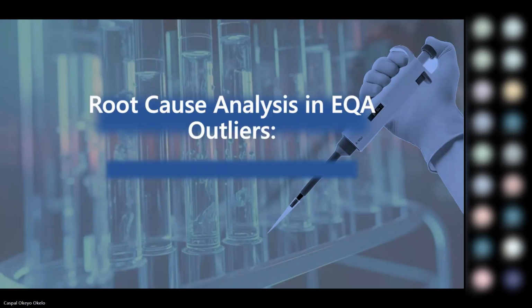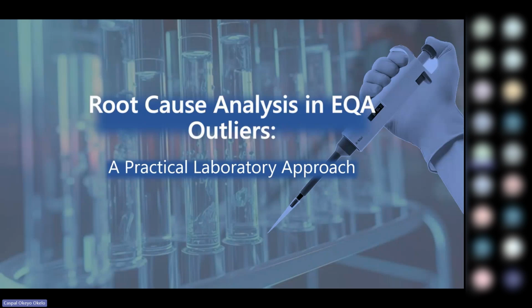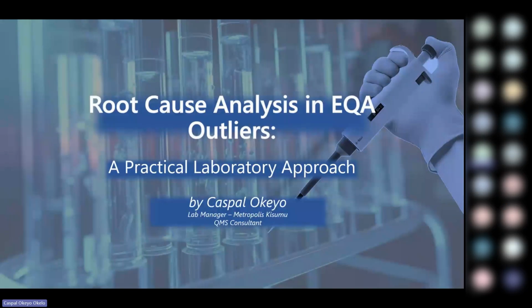And as has been introduced, this session is going to be a practical approach. The aim is that after 1 hour, you'll return to your lab and immediately strengthen how you investigate EQA failures. My name is Caspal Okelo. Currently, I'm the laboratory manager at Metropolis Kisumu, and I'm also a certified QMS consultant, as Kevin has introduced. I guide and mentor labs towards accreditation.